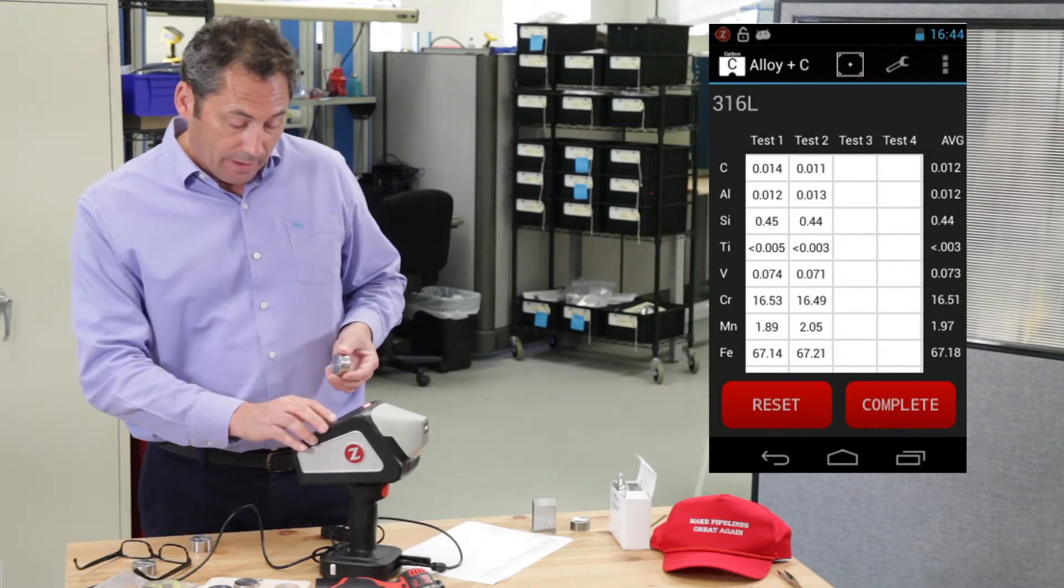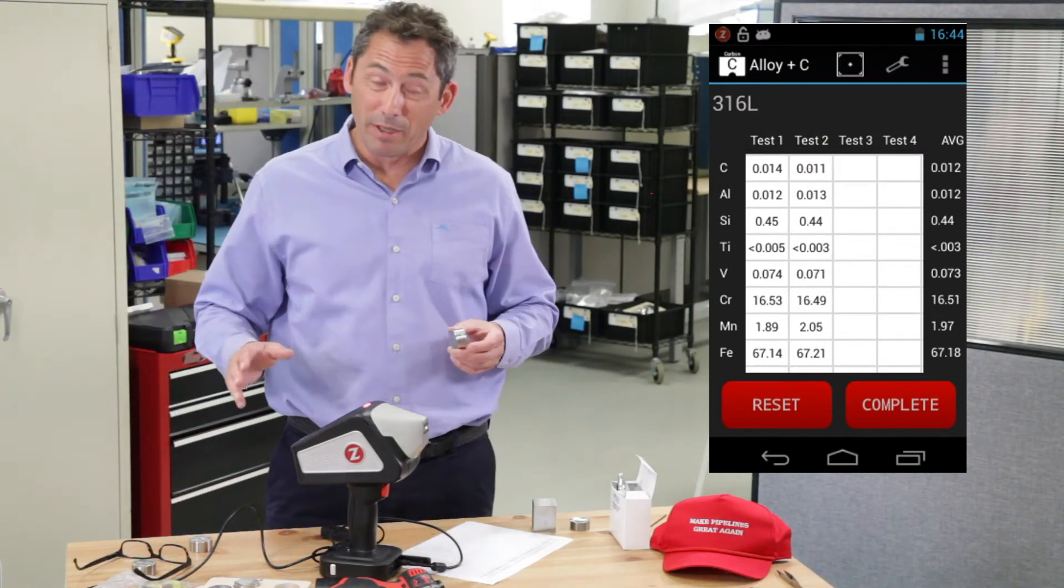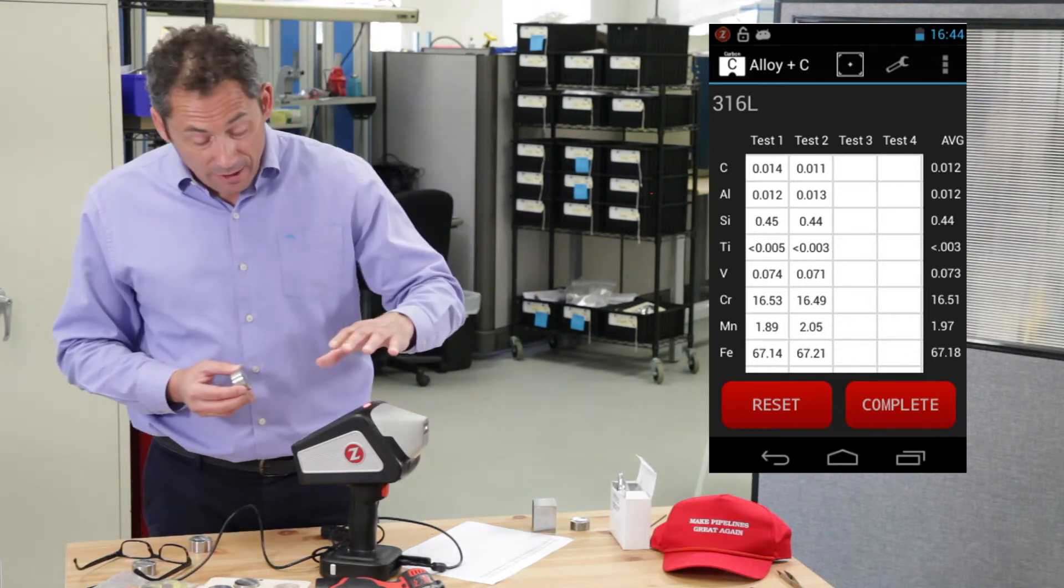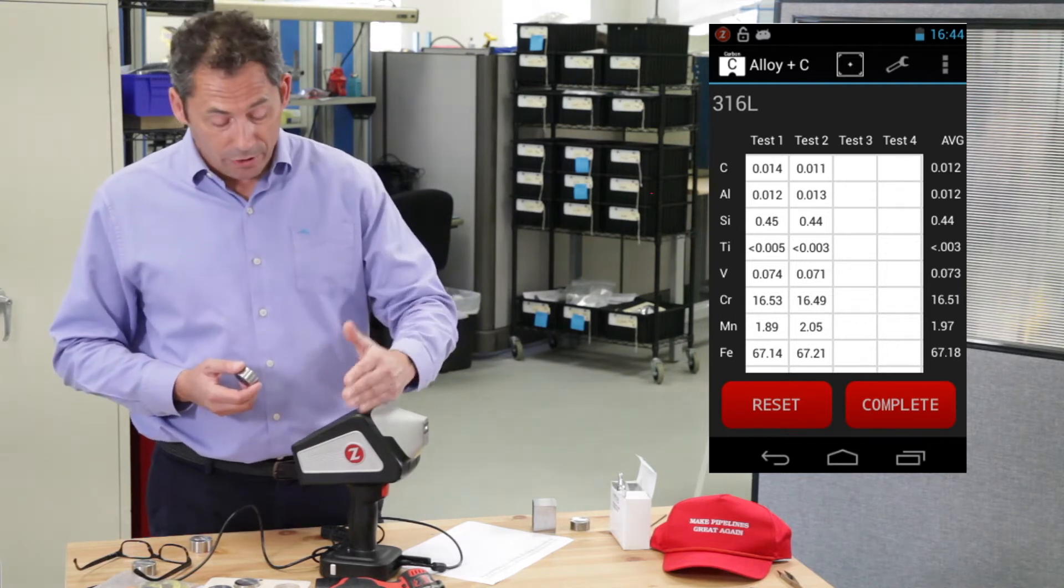So I did a couple of quick tests. Average of two tests, 012. So a little low by 40 ppm, but that's pretty good for about a six, seven second test. So the point is, because the carbon signal is stronger, we can do these L-grades with higher precision.